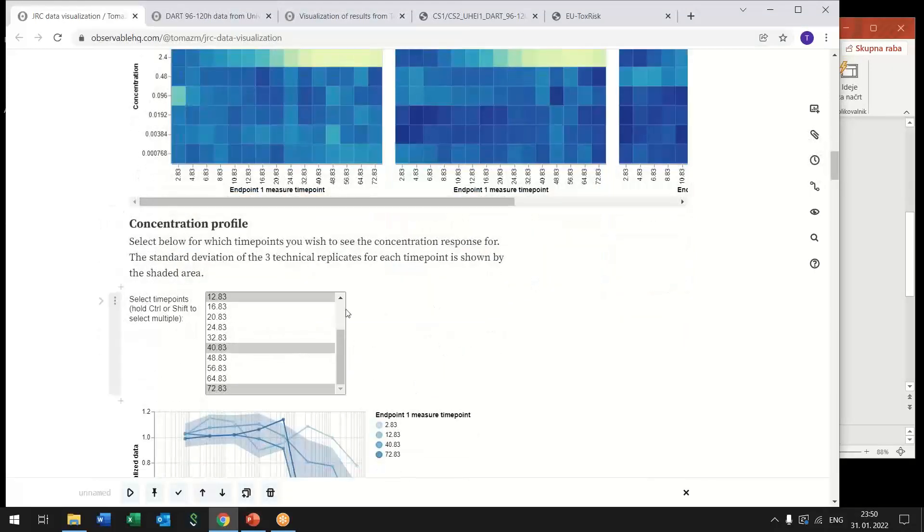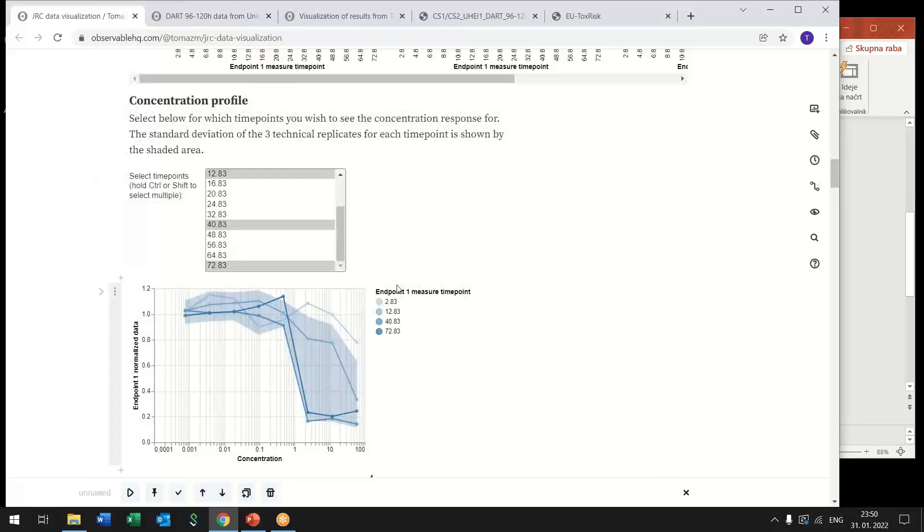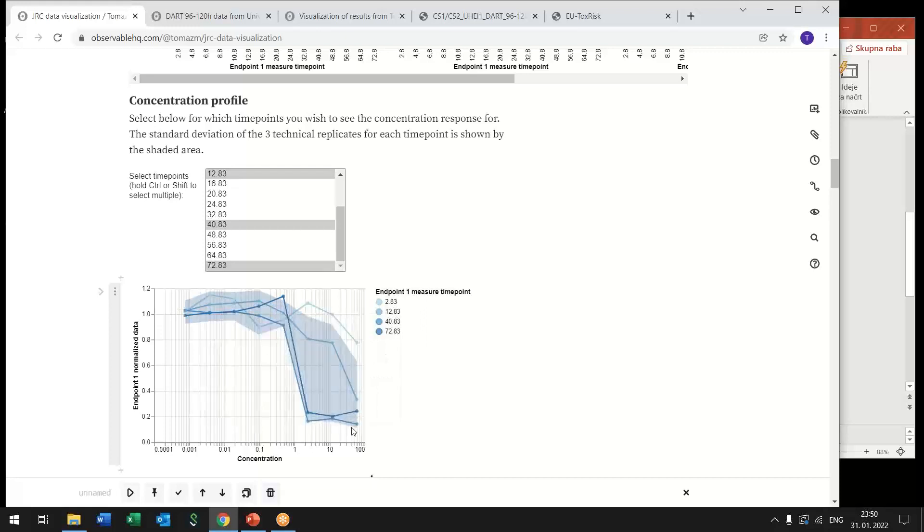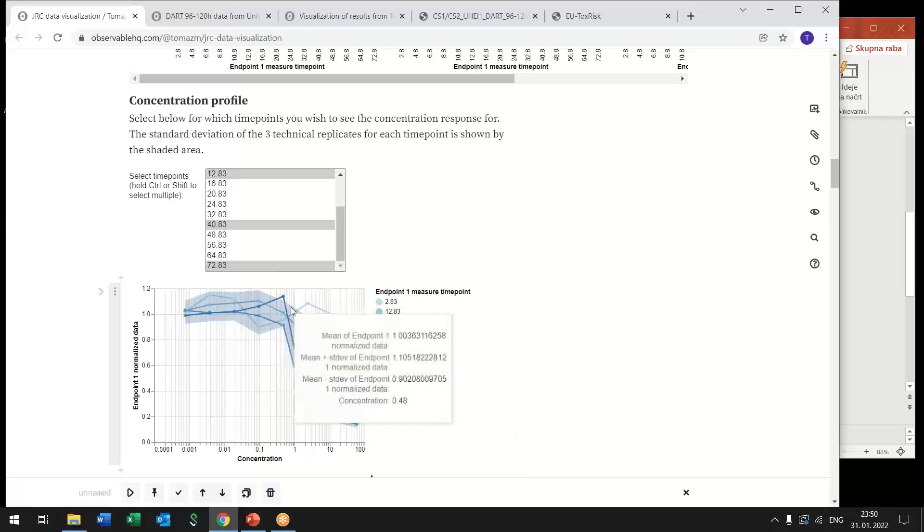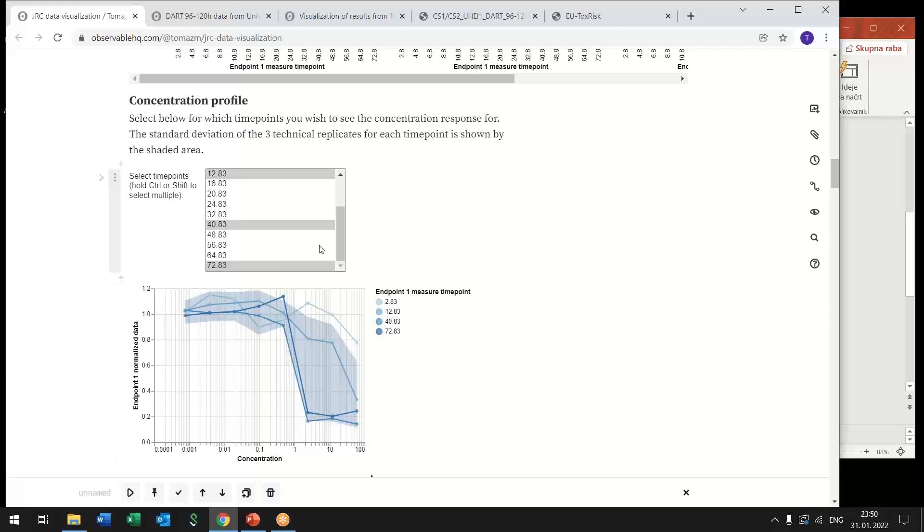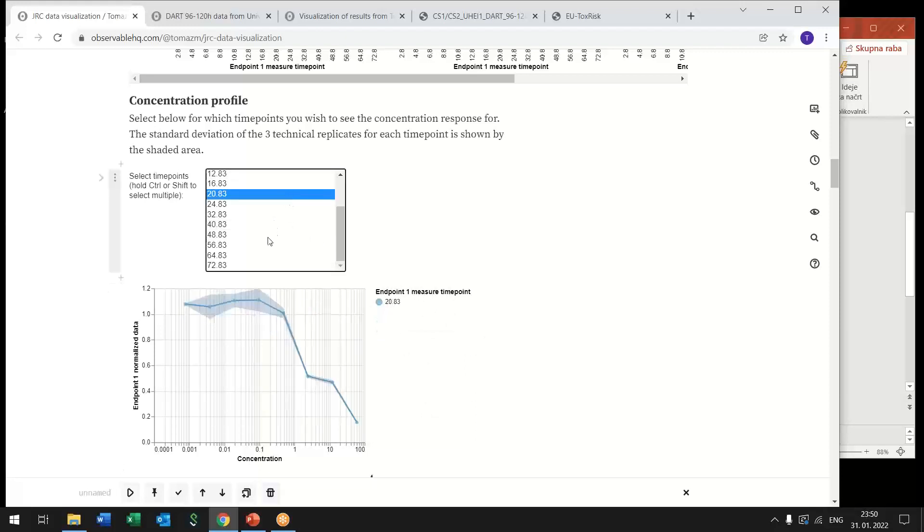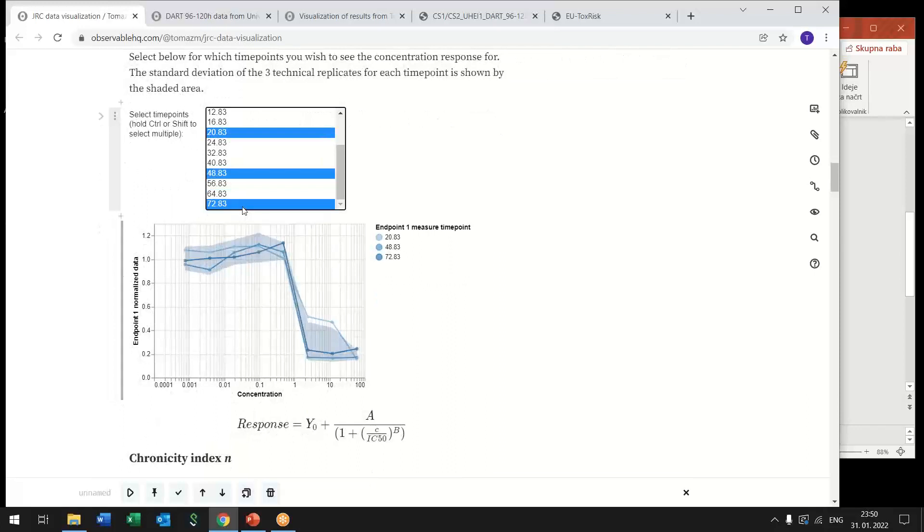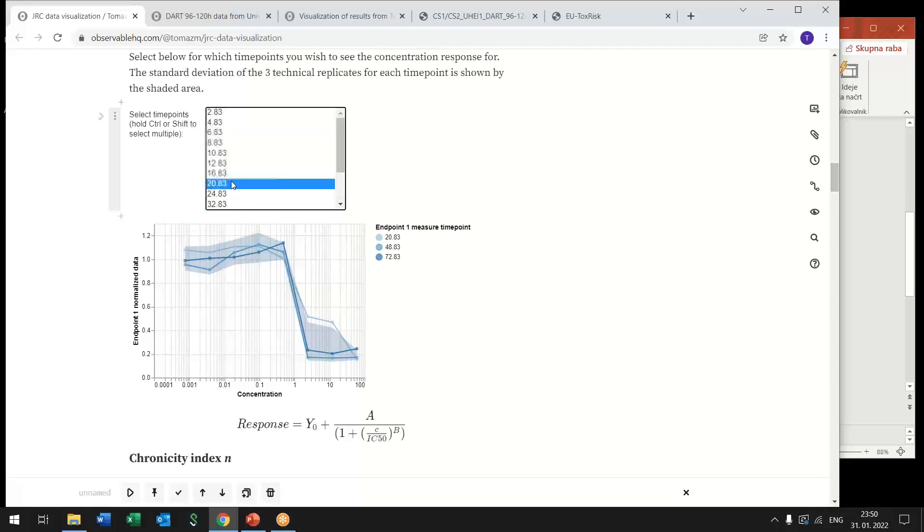So such heat maps can also be represented as a line chart where we have cytotoxicity versus concentration profile and different lines correspond to different time points and with selection of these time points we can have this immediately we get updated graphs and we can look only at the conditions that are interesting for us.